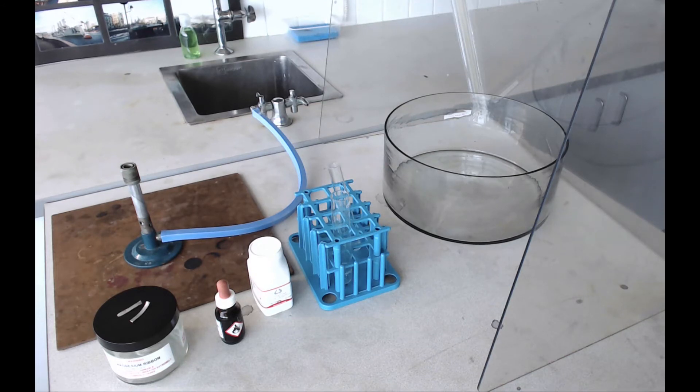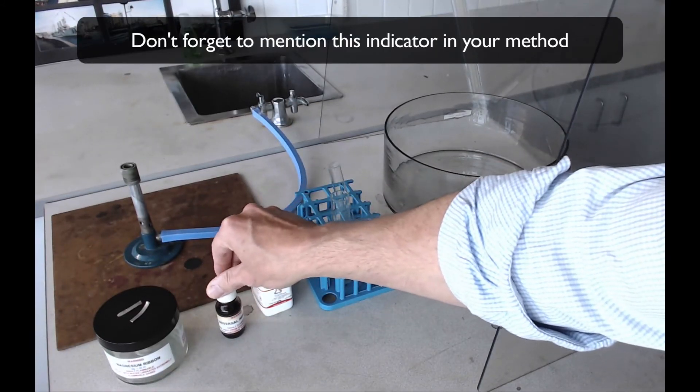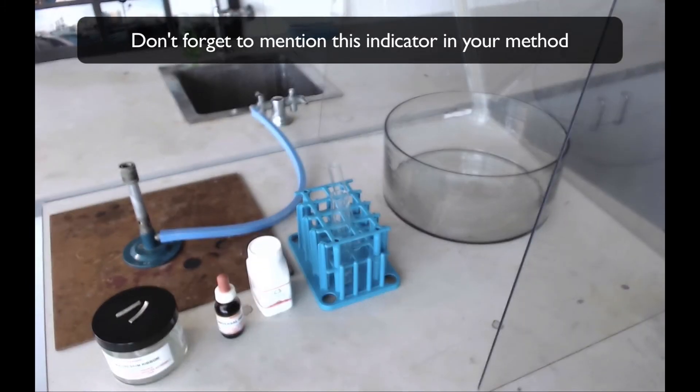The test with all three of these group one metals is the same. The trough will be about half full of water, the metals will be dropped into the water, we'll observe how they react, and once the reaction is finished, we'll put a bit of this universal indicator in to see what's happened to the water after the reaction.